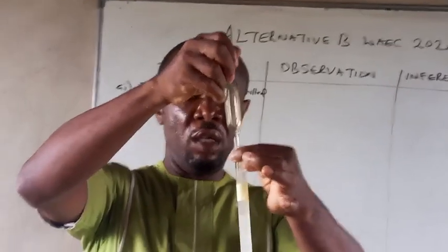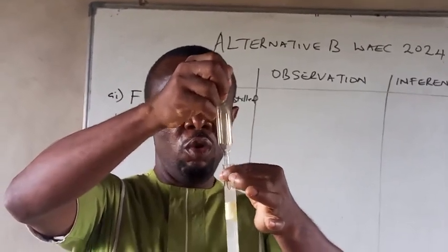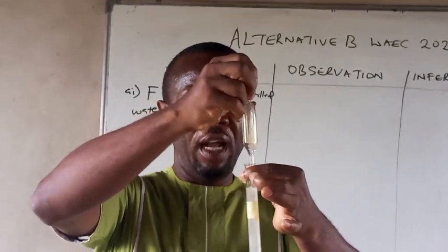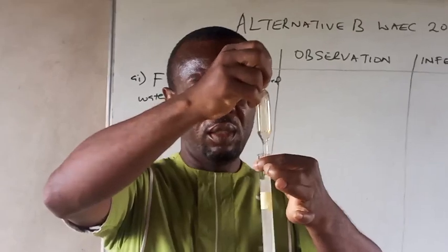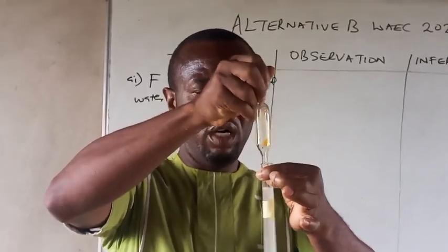Remember that F is the solid. But after dissolving F in water, we no longer have F solid. We now have F aqueous. F aqueous means solution of F. So be mindful of what you use when reporting your tests. So we stir F very well.